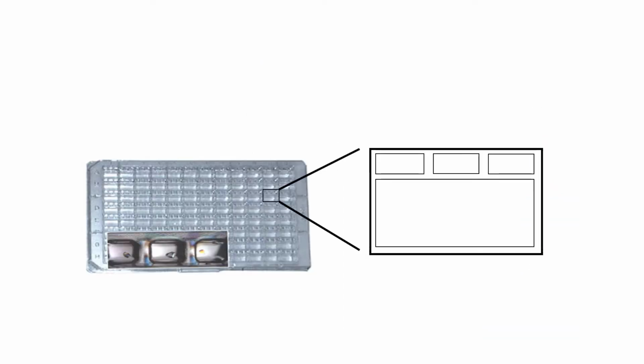After getting the pure protein sample, we can start doing protein crystallization. Because we don't know the buffer conditions in which a protein is able to crystallize, we need to try tens, hundreds, or even thousands of different crystallizing buffer conditions. These conditions vary by salt, precipitants, and metals used and at varying concentrations.